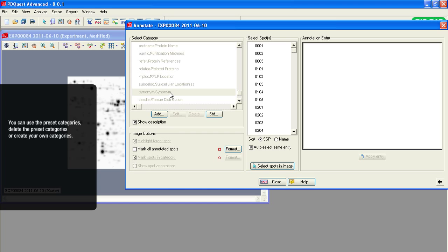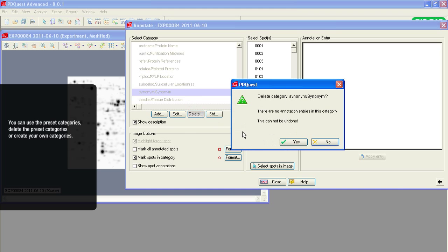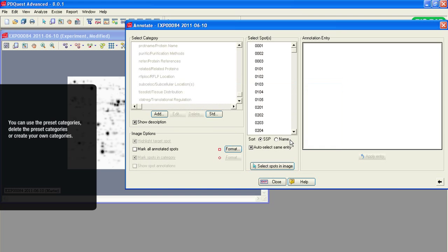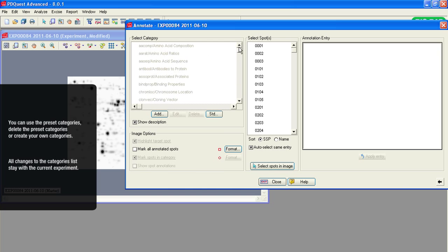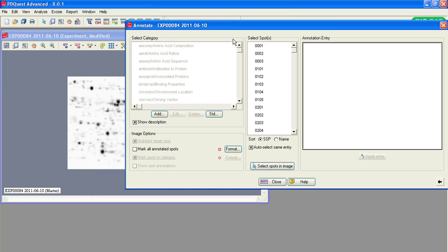You can use the preset categories or create your own new ones for this experiment. You can decide to delete the preset categories and keep only the categories relevant to your experiment. For example, you can delete the synonym preset category. All changes to the categories list stay with the current experiment.